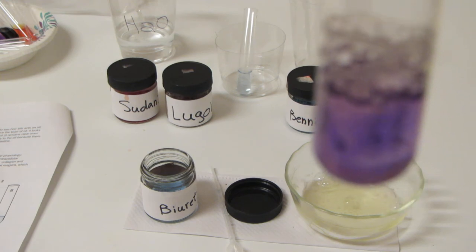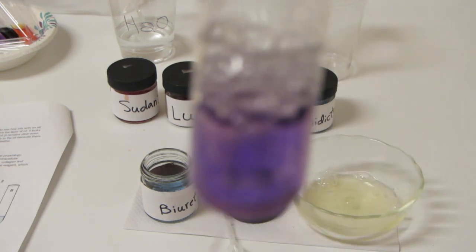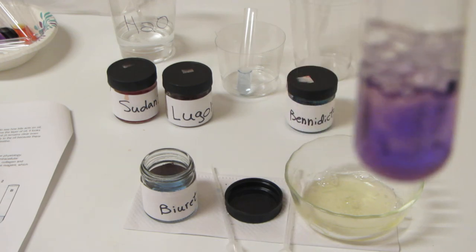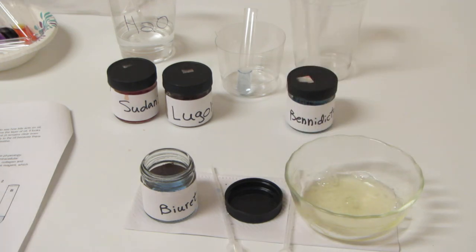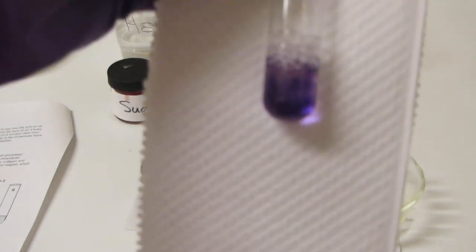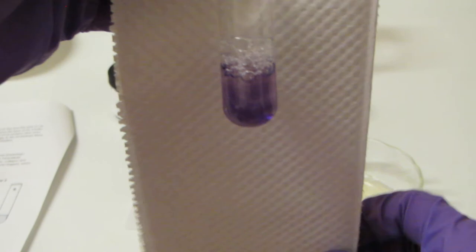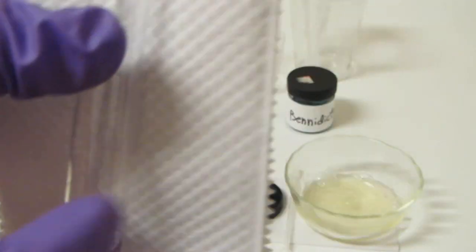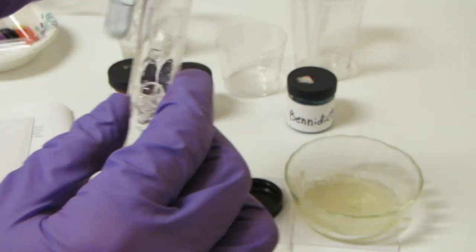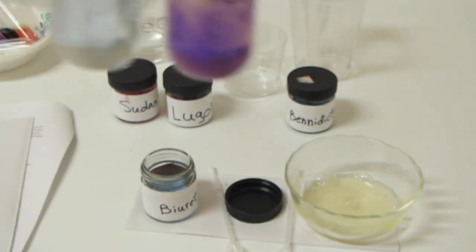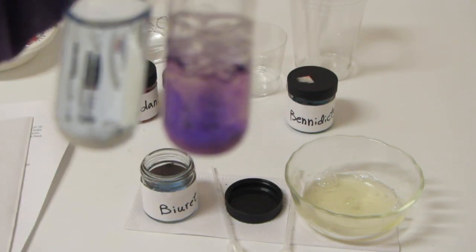And look what's going on here. Our Biuret solution has changed from that light blue to this beautiful lavender purple. In fact, I'm going to put that up against the white background for you. And you can see that we've got this beautiful shade of purple. In fact, it's getting close to the color of the purple gloves that I'm wearing. And if I go ahead and grab the tube that has the Biuret mixed with water, now you can see the color difference here.